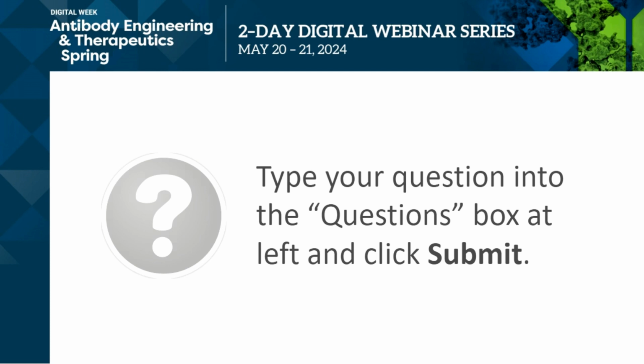Great, thank you. And how do you compare the nanobody generated from mouse to the one from camel? So from the data we have so far, the affinity and the specificity are very similar. Even though we don't have a direct comparison, based on the publication data, I think the behavior is often the same.